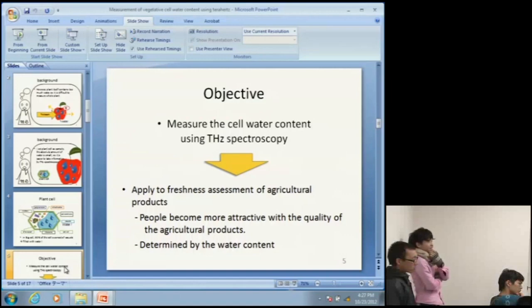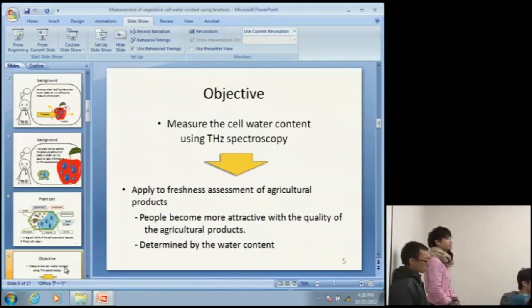Cell wall depth. For example, if the cell wall is 10 micrometers and the penetration depth is 20 micrometers, only slight information can be obtained from the ATR spectrum. So a slight change inside the cell may be difficult. So you need to find some other way. Okay, thank you.